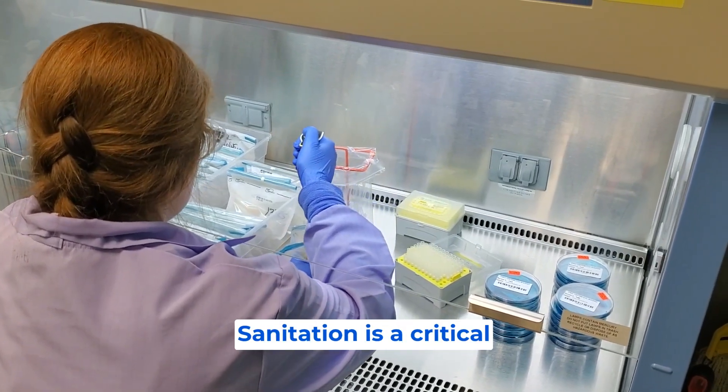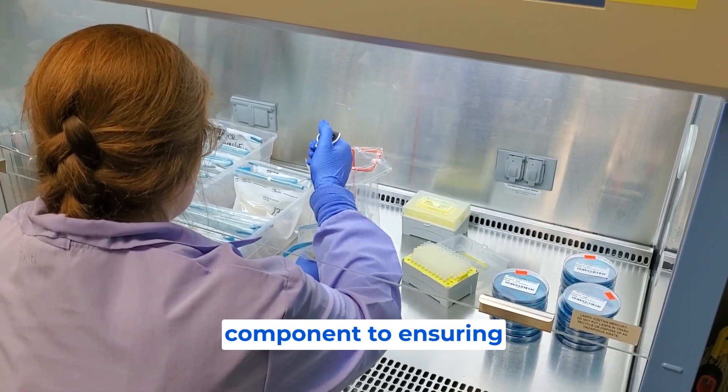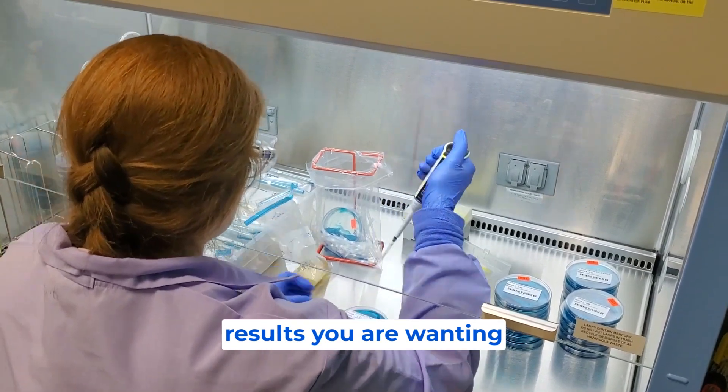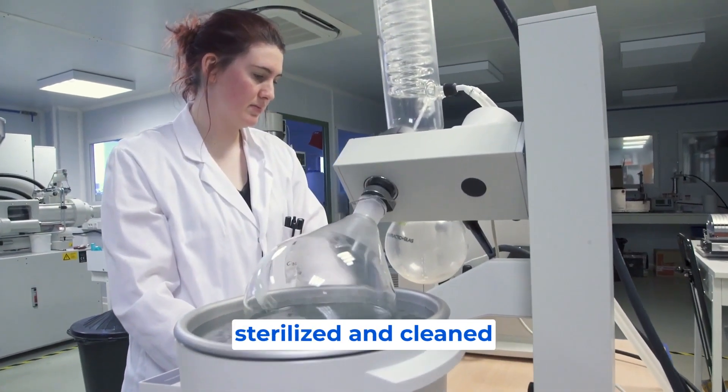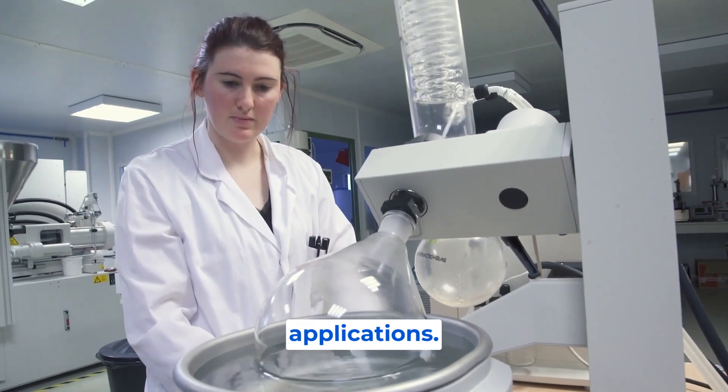During any laboratory testing, sanitation is a critical component to ensuring the accuracy of the results you are wanting to achieve. All of the equipment used must be properly sterilized and cleaned prior to any new applications.